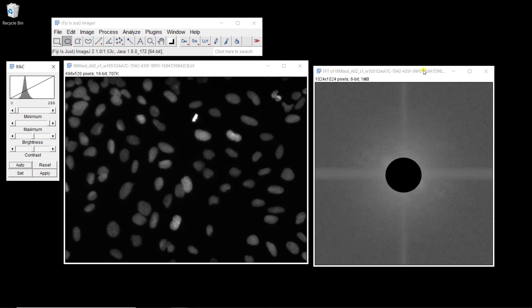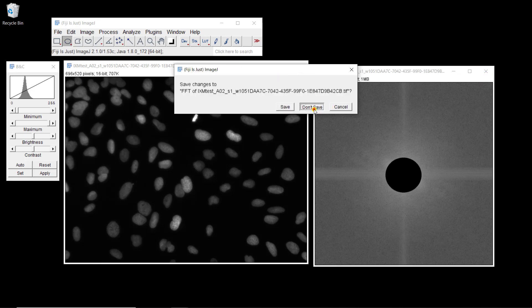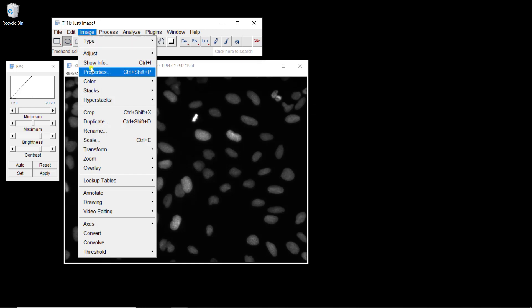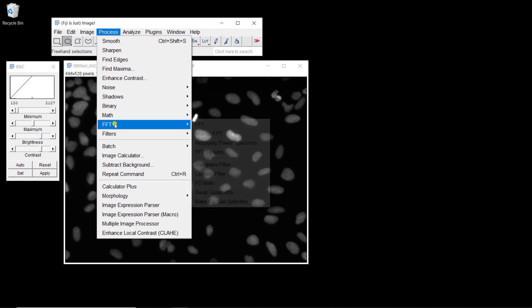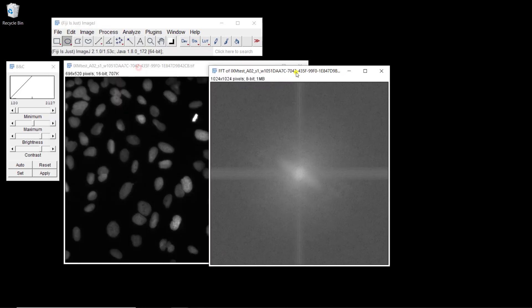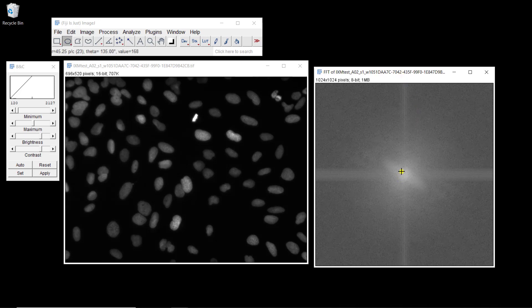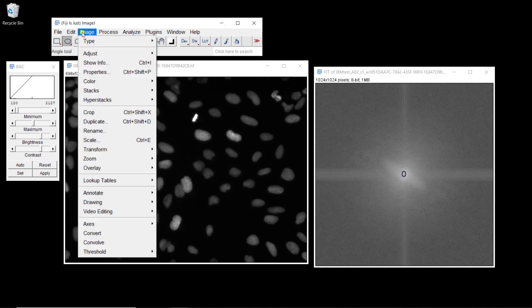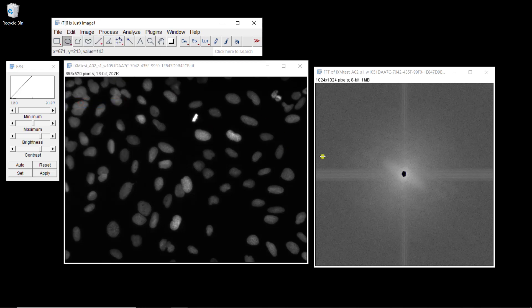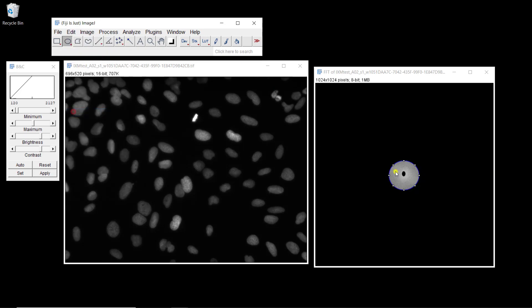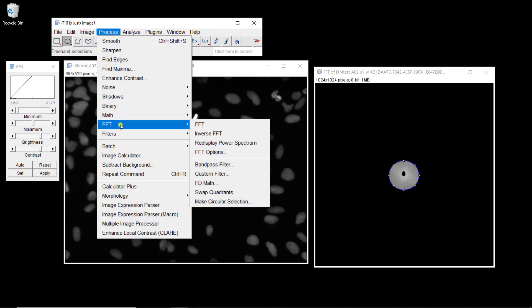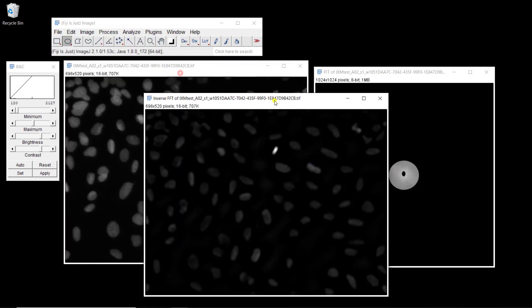Now there's one last thing we can do: a bandpass filter. We're going to remove the high frequencies and the low frequencies. Let's compute again the FFT of the image, and we're going to start by removing the low frequencies. I'm going to select a region like this, go to Edit and Clear, and now we're going to define the high frequencies — we're going to Clear Outside. Now we just have this frequency band. It's not very symmetric, but it's okay, just to have an idea of what it gives. If we do an Inverse FFT, this is what you get.